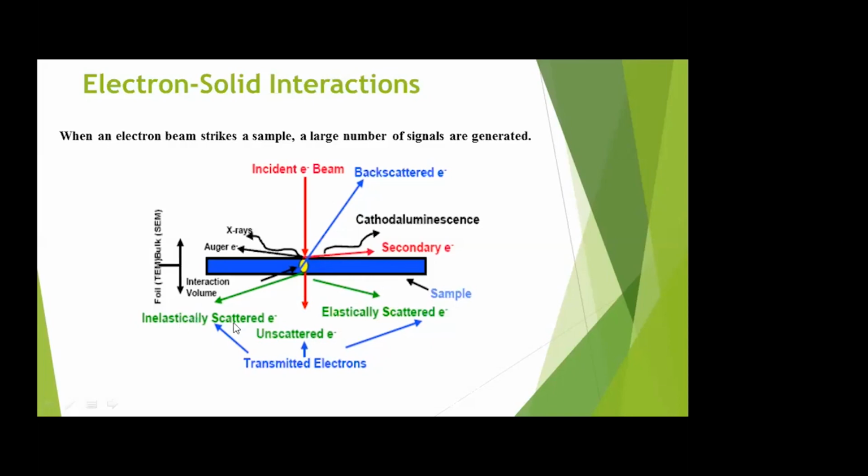What about inelastic scattering? In chemistry, nuclear physics and also particle physics, inelastic scattering is a fundamental scattering process in which the kinetic energy of an incident particle is not conserved. In an inelastic scattering process, some amount of the energy of the incident beam will be either lost or sometimes it may be increased also. That means it is not the same kinetic energy that is conserved.